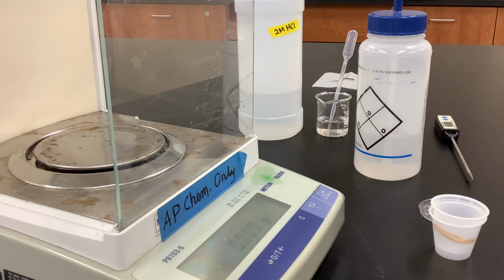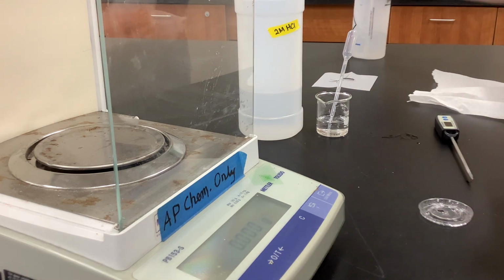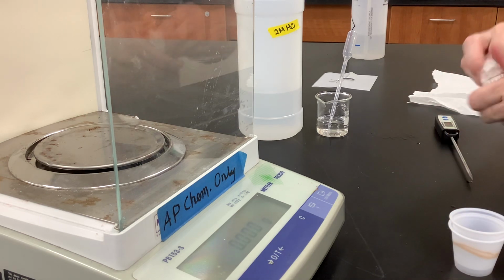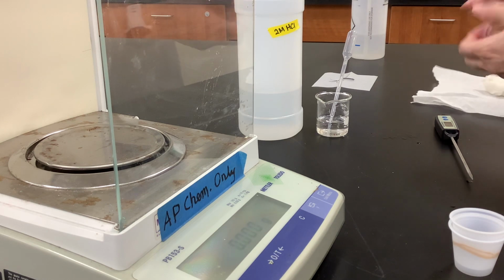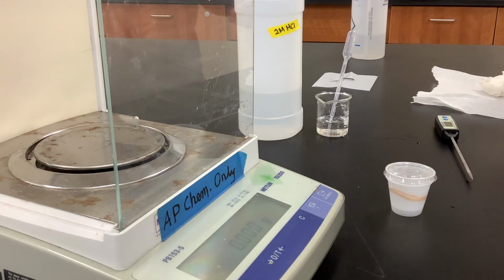Now, the reason why we want to dry that container is because we want to make sure that we don't dilute our hydrochloric acid down, right? We want to make sure, you know, we're not making our reactions go a little longer. Okay, so we dry the best we can with what we've been provided. Okay. Right. Okay. And then we're going to repeat the process.